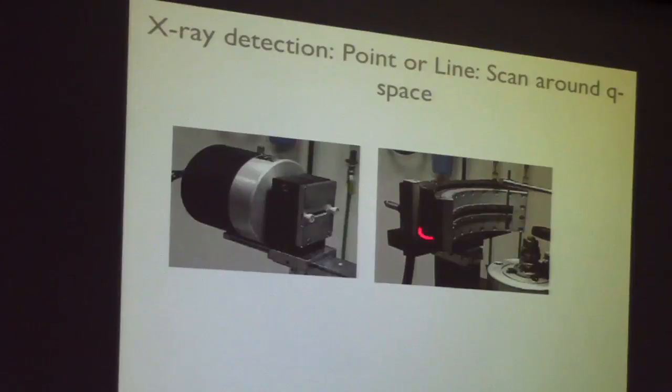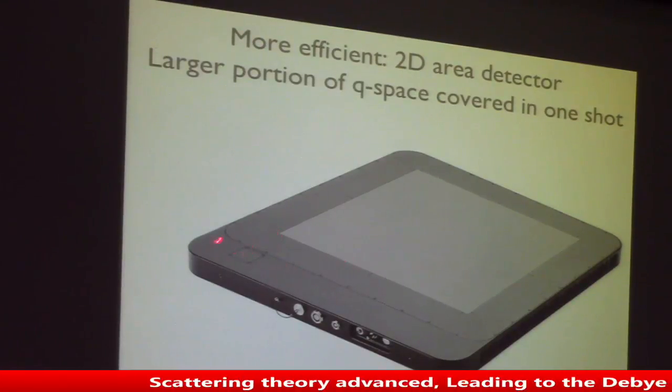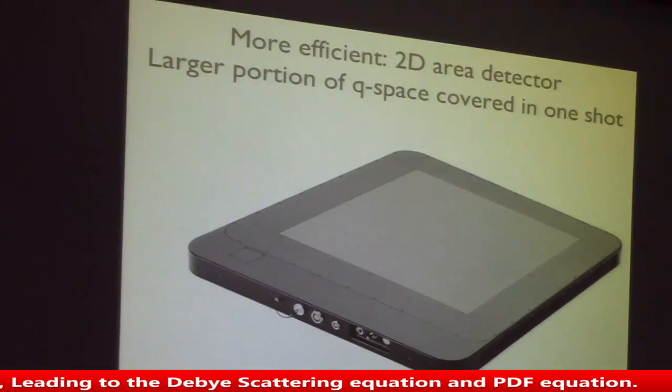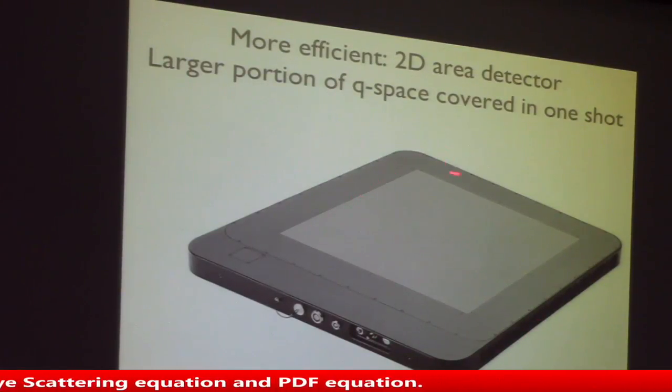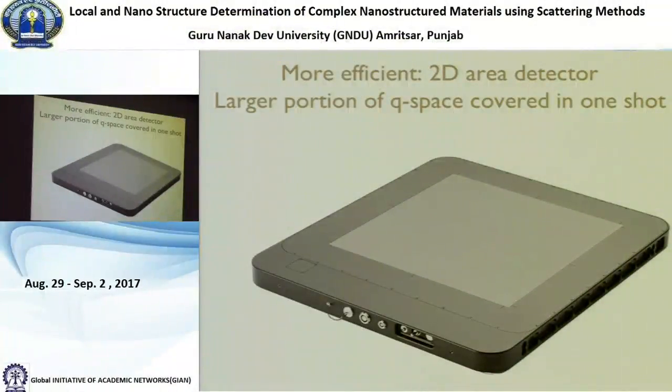These are better than the scintillators, except that it's very easy to take a scintillator and turn it into a large area 2D detector. The detectors we're using mostly right now at synchrotrons are these very large area 2D detectors, and they're basically working on this scintillator technology. They have a scintillator on the front, and behind that an array, something like 2,000 by 2,000 little patterned electronic chips underneath, and the light goes through to each chip.